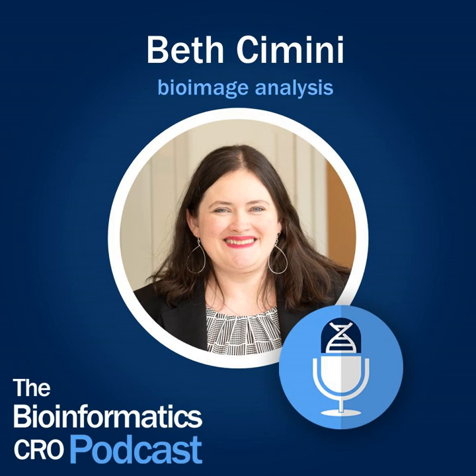But saying, hey, we have tons of biologists making biology data, we should make sure it's really quantitative and useful, is a thing that it now seems like more and more core facilities that I'm aware of are starting to have bioimage analysts on staff, which is a great step one. We ourselves have been running for a few years now a training program in bioimage analysis for postdocs, where we take awesome folks from the wet lab and train them in bioimage analysis. But I think definitely the demand for help with quantifying images currently outstrips the supply.